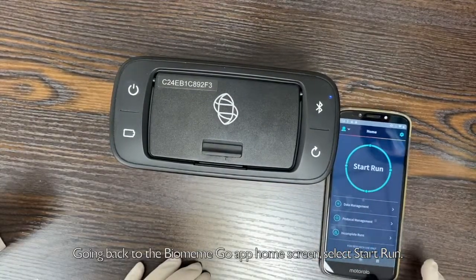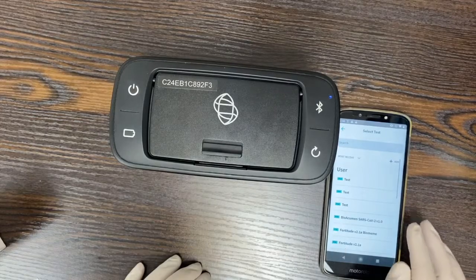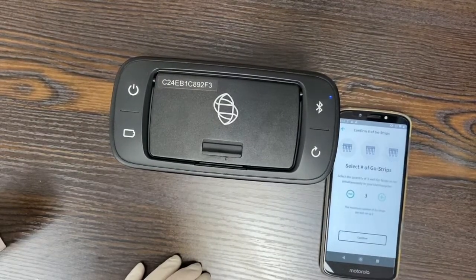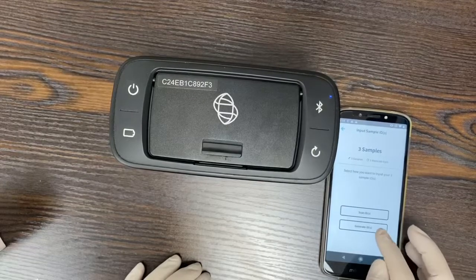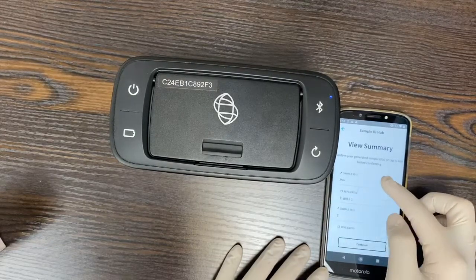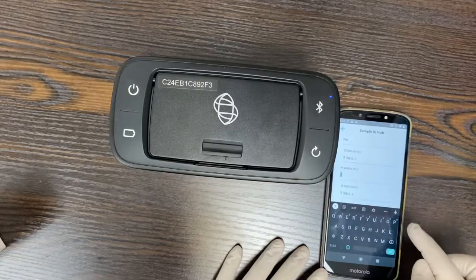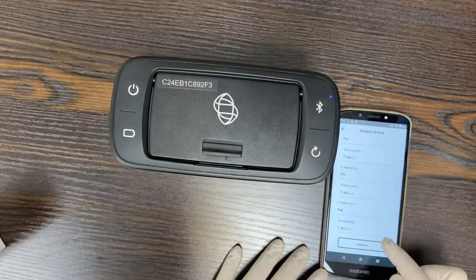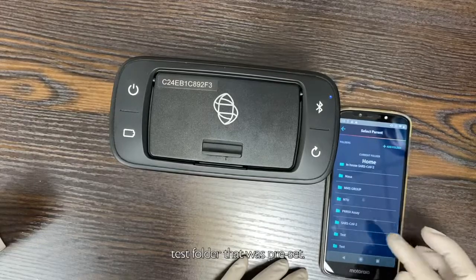Going back to the Biomeme Go app home screen, select Start Run. Press Select Test to input your own protocol. Select the number of PCR tubes inserted, and name each tube. Select a folder to save the results in — as an example, we will save it in the test folder that was preset.